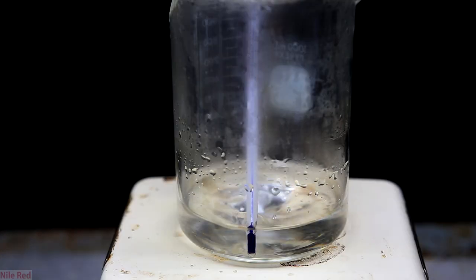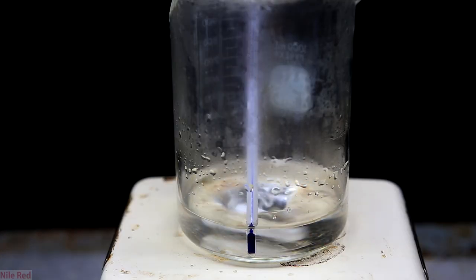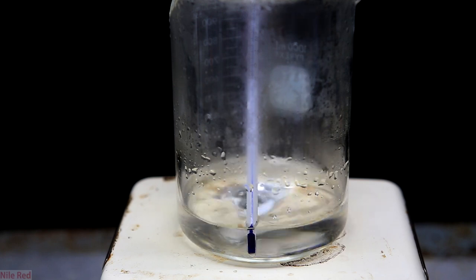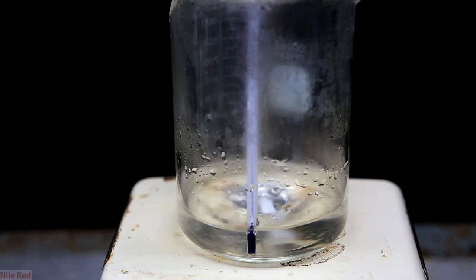When the volume got low, I added a thermometer and I monitored the temperature. Ammonium formate melts at 116°C, so we have to make sure we don't overheat it. I would keep the temperature between 115 and 120 degrees Celsius for a while.